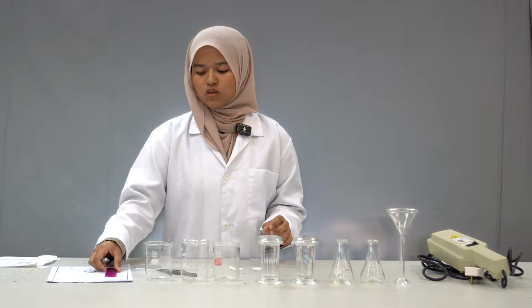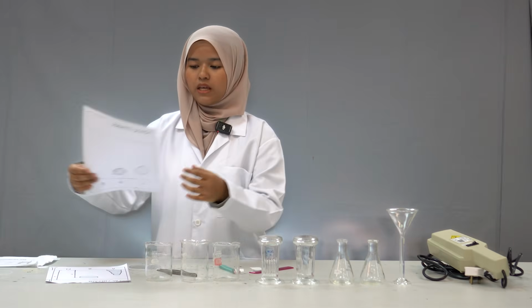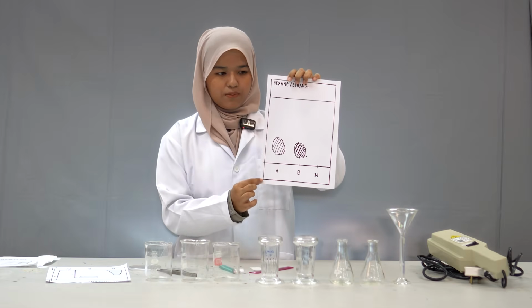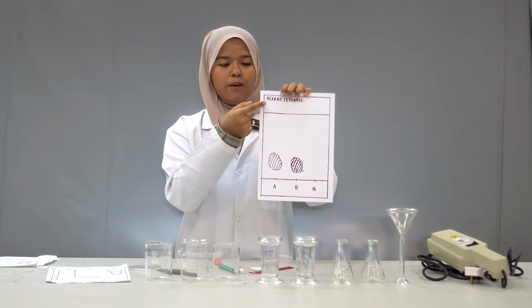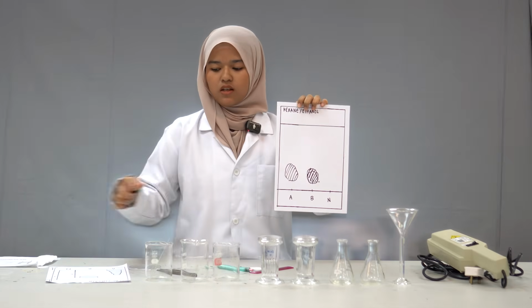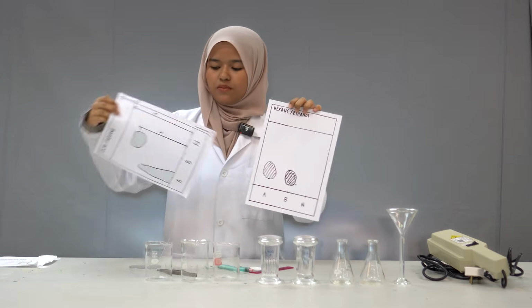First, we use a pencil and a ruler to make the baseline and the front line like this, 1 cm from the bottom and 1 cm from the top. Then you label each TLC plate for its solvent. This one is for hexane and ethanol, and this one is for DCM and hexane.